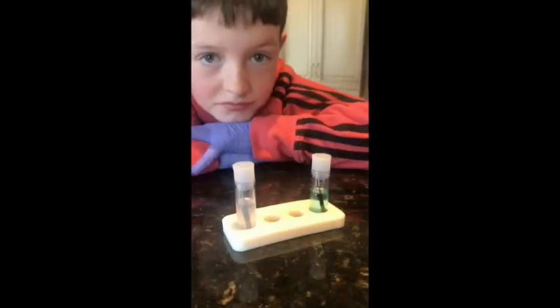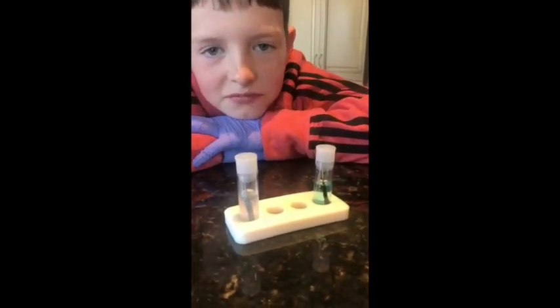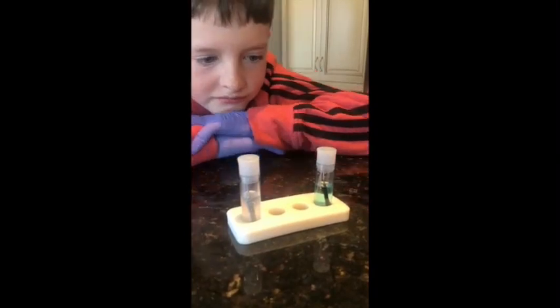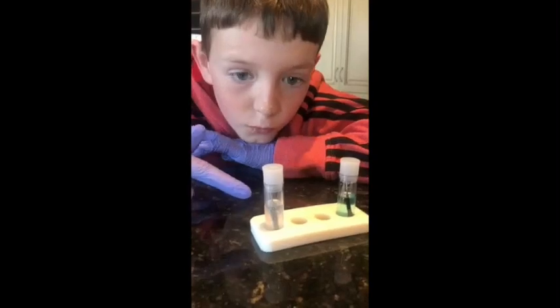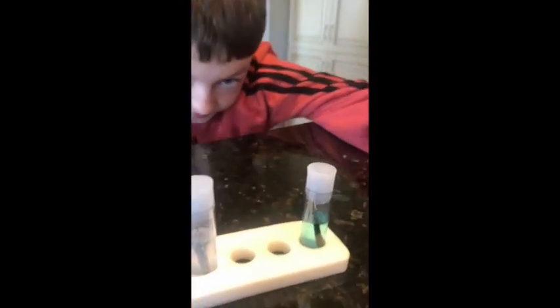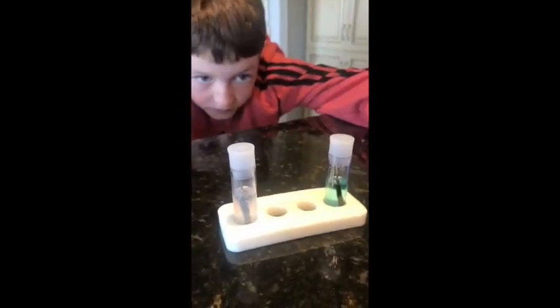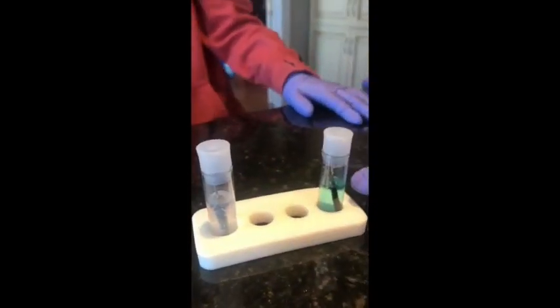So we're back after 5 minutes of letting these vials sit. We thought we'd give you an update on what Duncan is observing 5 minutes into this reaction. I sort of see fur off a wolf on that one. And then I sort of see black. Just straight black. Describe the solution, Duncan, the liquid part in this one. What does it look like? It looks like the solution over here. What does that one look like?